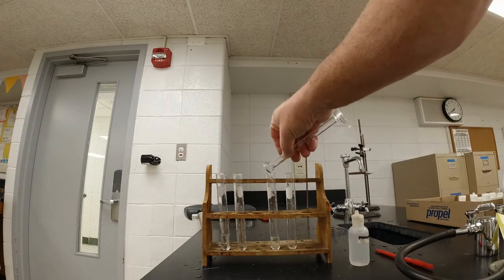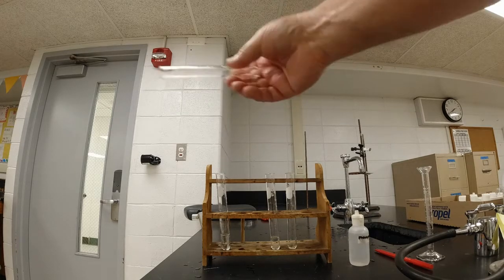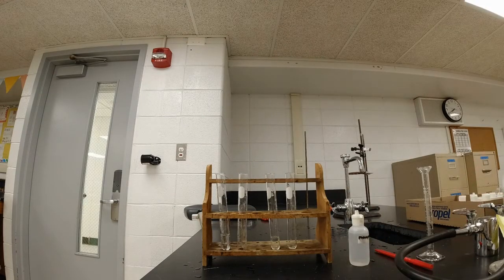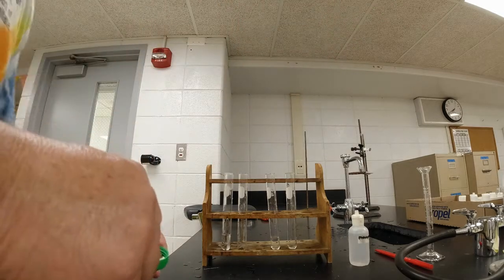Now, what the second tube is for is I'm going to put this over the top of this, and I'm going to try to catch whatever gas comes out of here. I'm going to do that with both of them. All right? I'm going to do these one at a time. I kind of have to do this quick so I can be ready here. I need to light my Bunsen burner. Be ready to go. So I'm going to take this calcium turning, and I'm going to put this into this first test tube. I need to be ready because it's a pretty fast reaction.